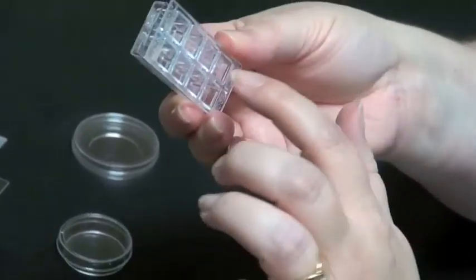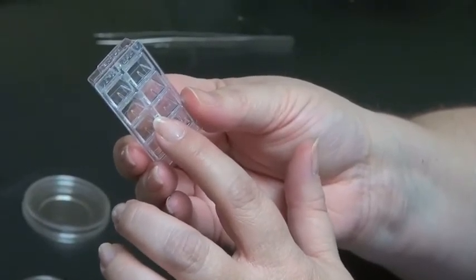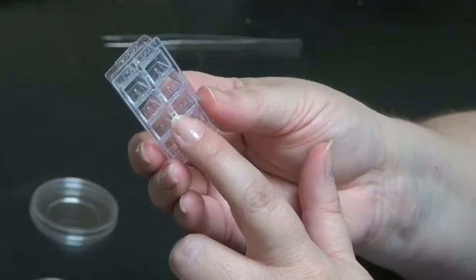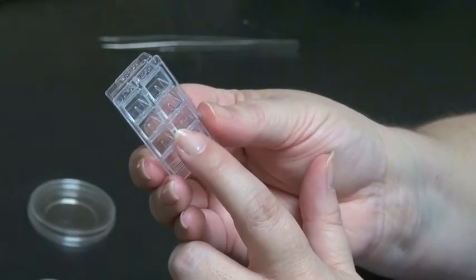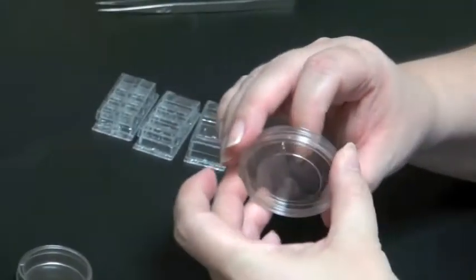The important thing to remember for the cover glass bottom is to ask your facility director what type of cover slip correction the objectives that you're going to be using have. It's very important to match that with the number cover slip on the bottom of these lab tech slides. These are 1.5's.